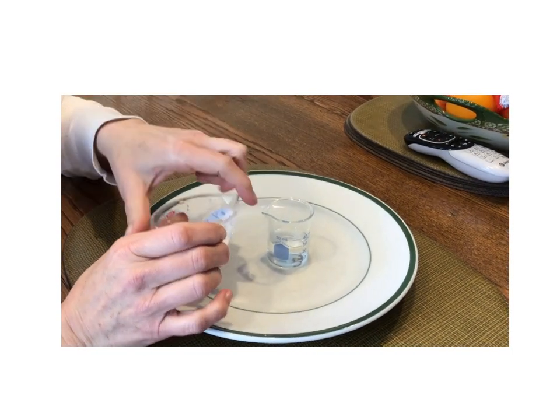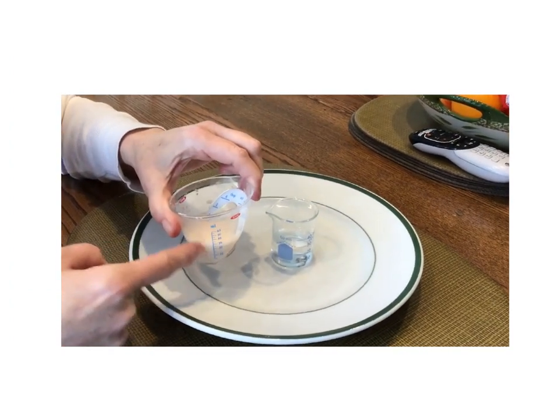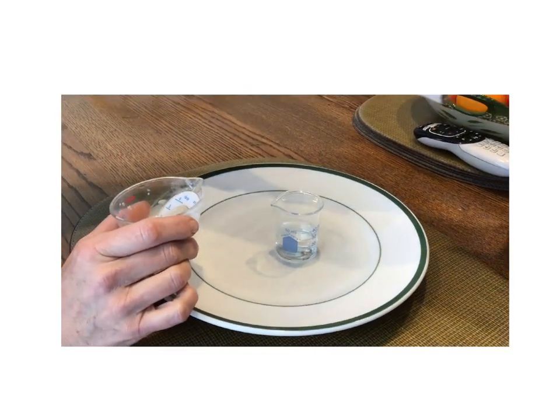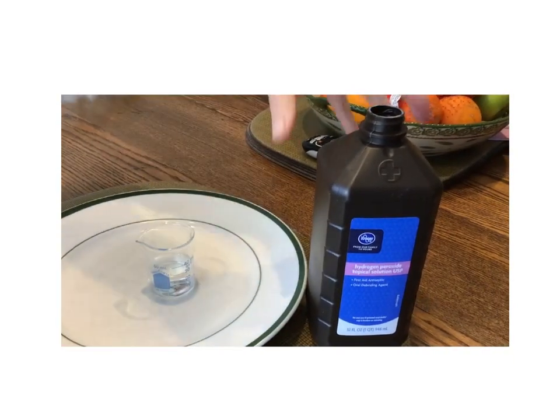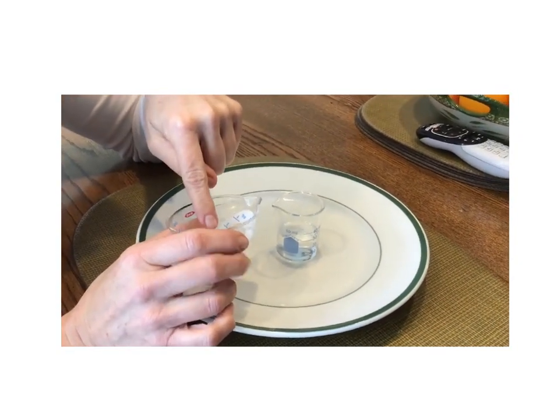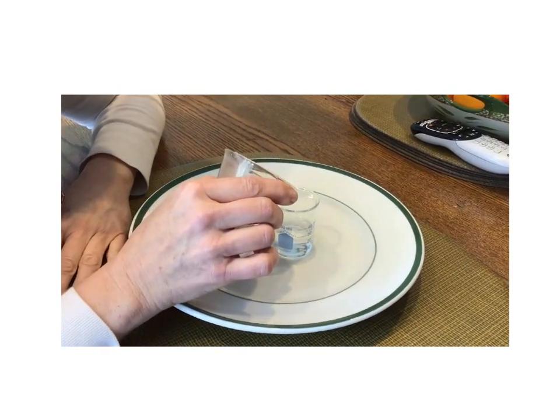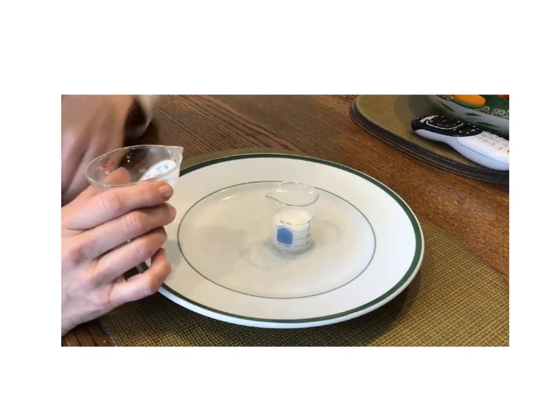So what I have here is some yeast that I've put in water, so it's kind of a mixture. And in here I have hydrogen peroxide, and it's hydrogen peroxide that you could get at the store, right? Same stuff. And we're just going to look and see what the reaction looks like. So this right here has the catalase in it, which is our enzyme. And when I pour it in, and you watch, you can see what happens.